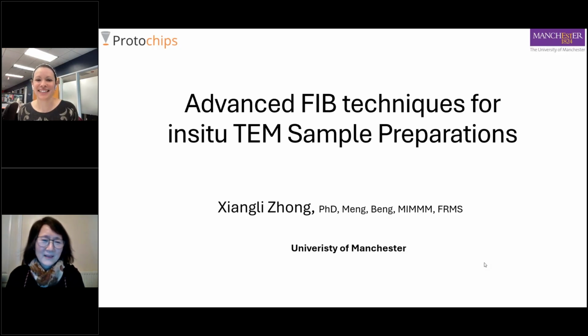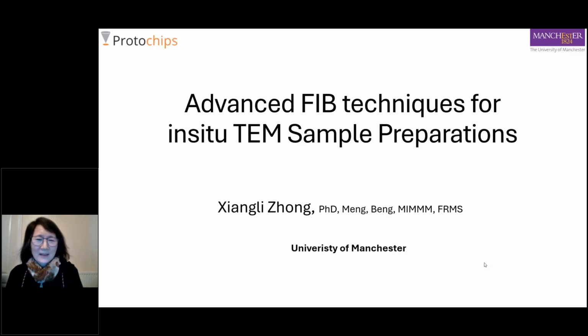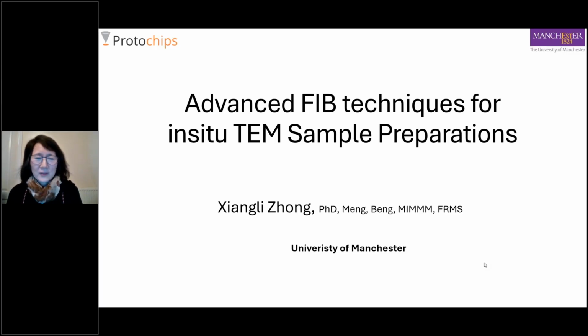Yeah, thank you, Jennifer. Thanks for the introduction. Hi, I'm Xiangli Zhong from the University of Manchester. I work as a cellular electron microscopy specialist, leading in the development of advanced FIB techniques. So today I would like to share with you our development on the FIB techniques for in situ TEM sample preparations.